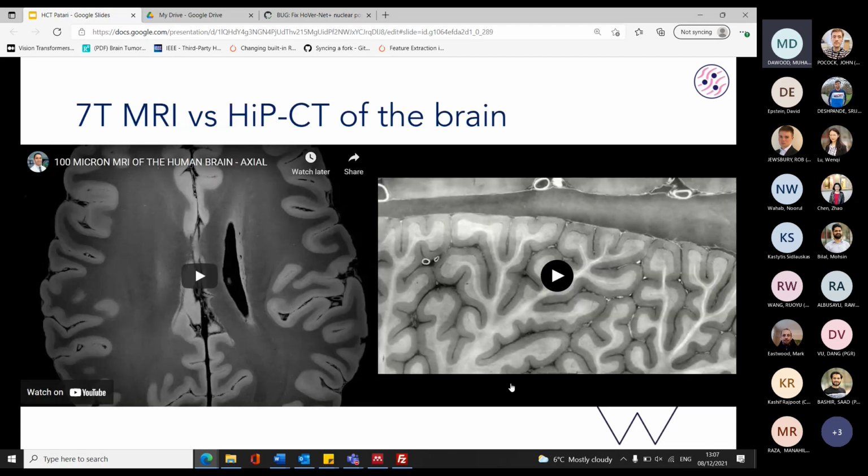Can you do something like CT? Can you do MRI and something like that? It's different, I suppose. The limiting factor with MRI is the field strength of the magnet, but with CT, the limiting factor is the intensity of the X-rays you can get. You get higher intensity X-rays because you're using a synchrotron, so it's more directed X-rays.